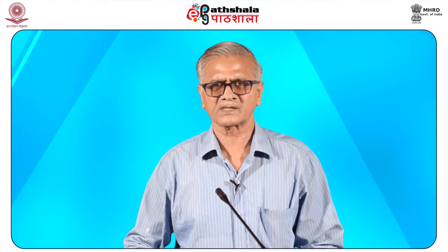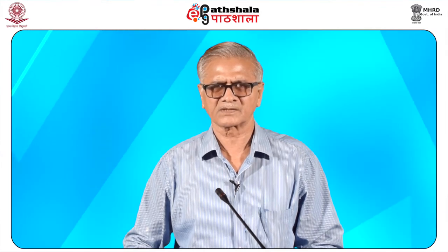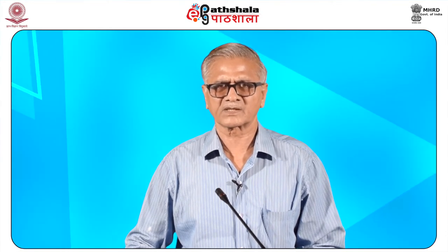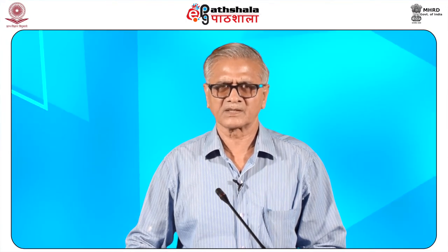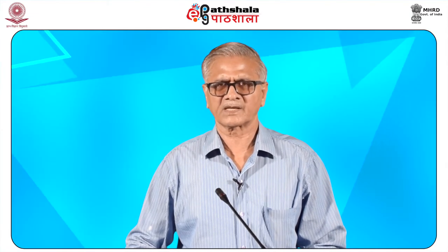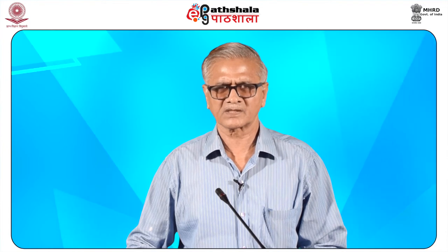There are two classical methods of sequencing. One is Sanger sequencing and another is Maxam-Gilbert sequencing. In 1977, Frederick Sanger published a method for DNA sequencing with chain-terminating inhibitors, and simultaneously during 1976 and 77, Walter Gilbert and Allan Maxam at Harvard also developed sequencing methods, including one for DNA sequencing by chemical degradation analysis.